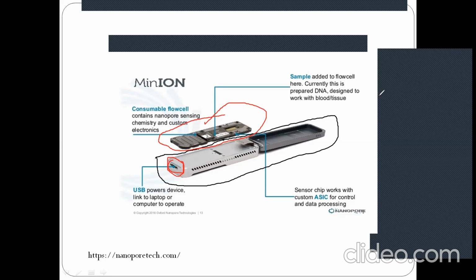Maybe initially, up to 4 or 5 sample runs, you found over 900 pores free. But from 6, 7 or 10 runs onwards, you found that at least 100 to 200 pores had already been choked. So maybe 700 pores are still available for your sample run.